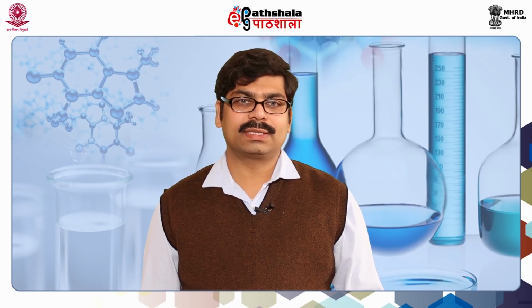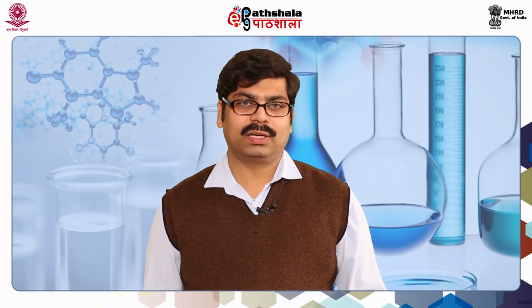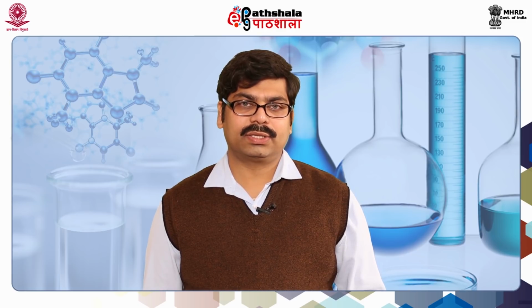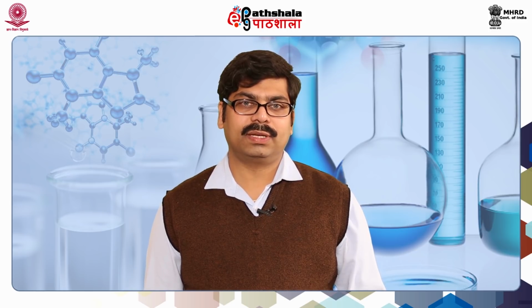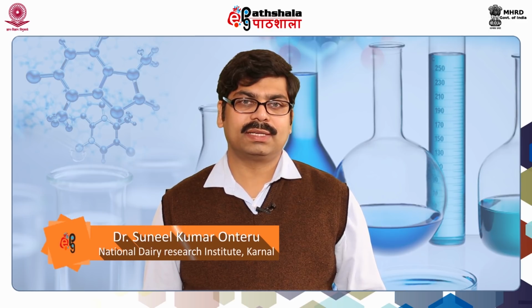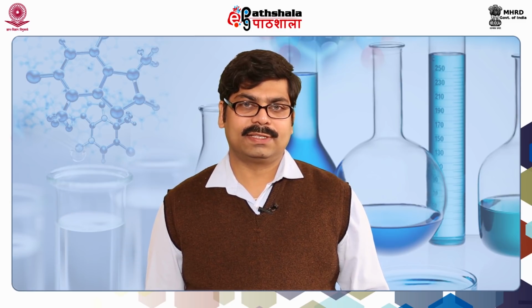Today we are going to discuss another lecture, on HPLC in the paper Biochemistry. HPLC means High Performance Liquid Chromatography. In this lecture, we are going to study the principle of HPLC, the instrumentation of HPLC and the limitations of HPLC, and finally we are going to discuss the supplements to the HPLC.